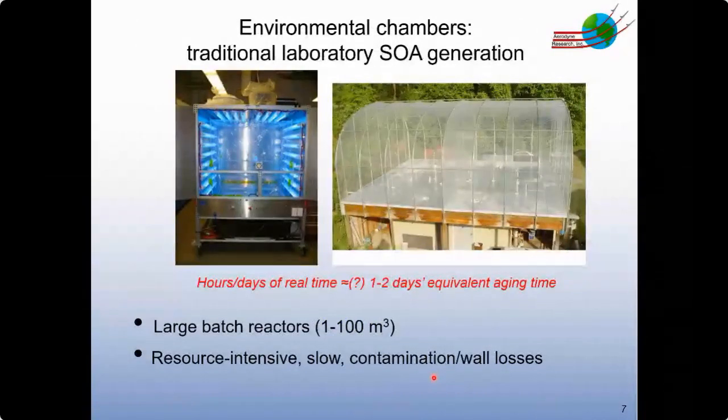Traditionally, these types of field observations have been supplemented by complementary studies in the lab, where research groups have used environmental chambers to introduce simple SOA precursors or mixtures of fixed VOCs that are thought to be important SOA precursors, and study their formation and aging over timescales of multiple hours to, in some cases, approaching days of real-time oxidative aging in the chambers. The state-of-the-art environmental chambers can mimic 1 or 2 days of equivalent aging time in the atmosphere in the lab with these large batch reactors that are used to study these processes.